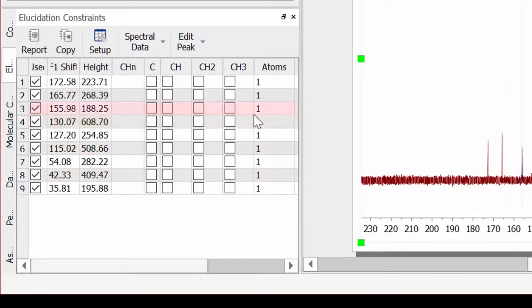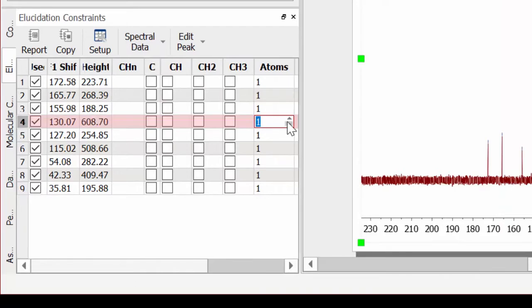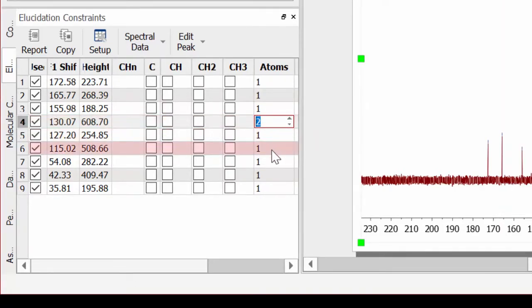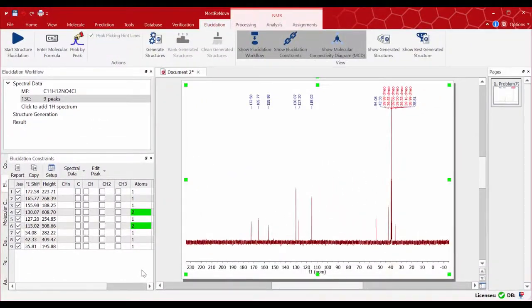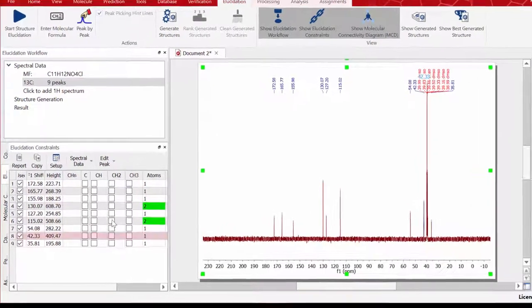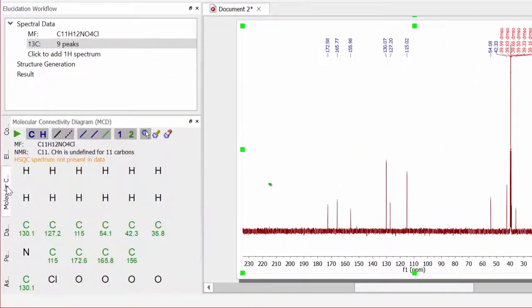On the table you can edit the number of carbons — for instance, type 2 for the symmetrical ones like the peaks at 115 and 130 ppm. You can now see how the warning message has turned black, confirming we have 11 carbons.